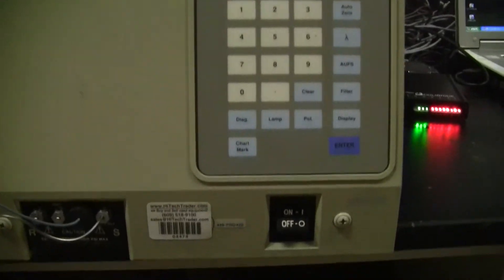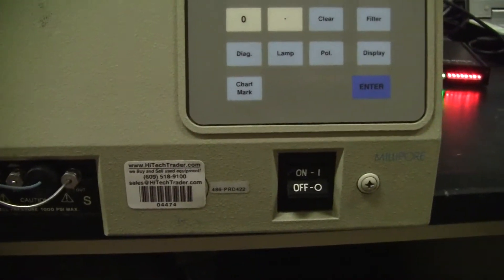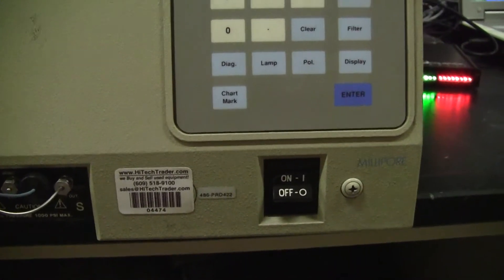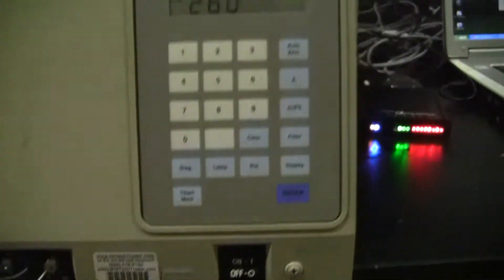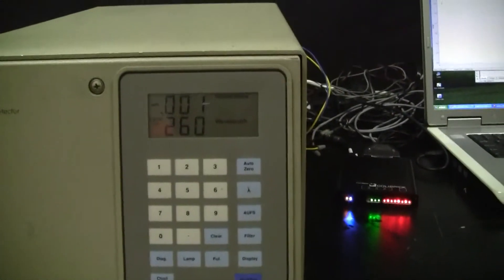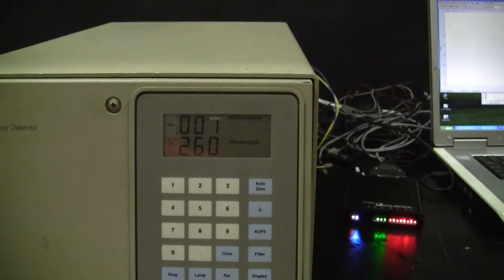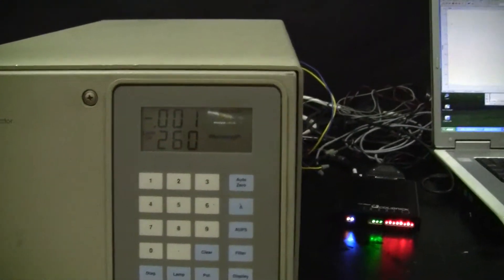The barcode on this particular unit is 04474. We've set the wavelength at 260 nanometers.